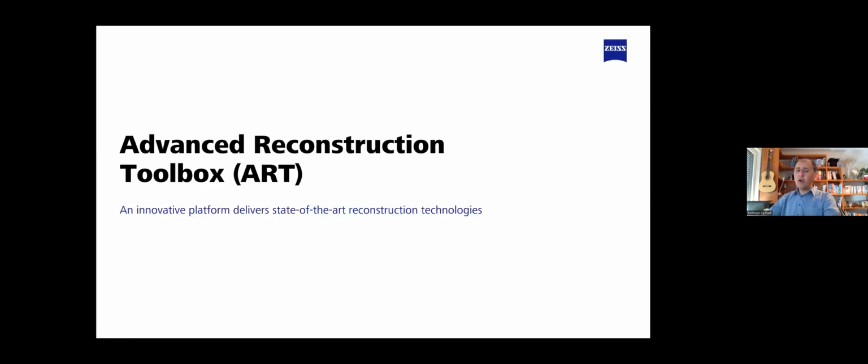So talking about ultra scans, scan time is becoming, in fact, an issue, sometimes if repeated scans are needed, like in situ investigations. Therefore, there are some modules to reduce the scan time by a factor of 10, which we will have a look at now, while keeping the scan quality like the original.